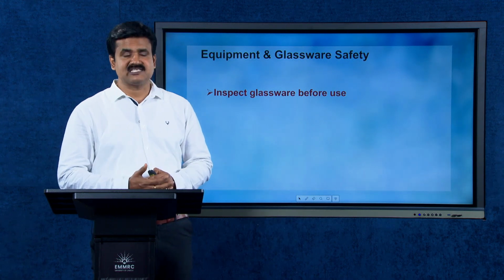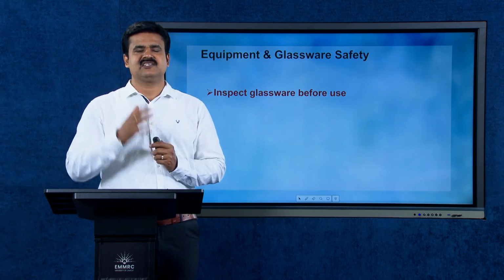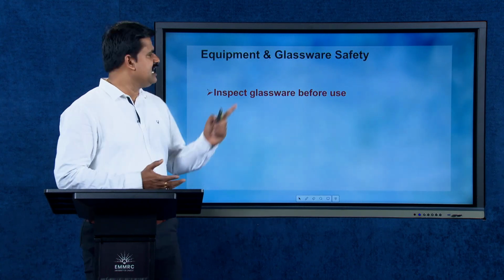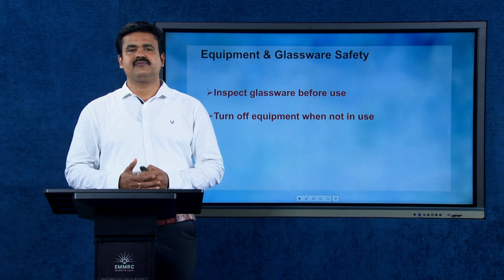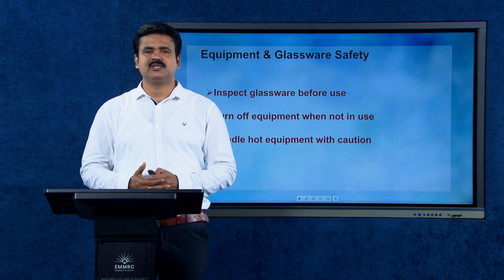Equipment and glassware safety is also a very important concern. To smoothly conduct experiments with the glassware and equipment, you can follow these instructions. Inspect glassware before use. Turn off equipment when not in use. Handle hot equipment with caution.